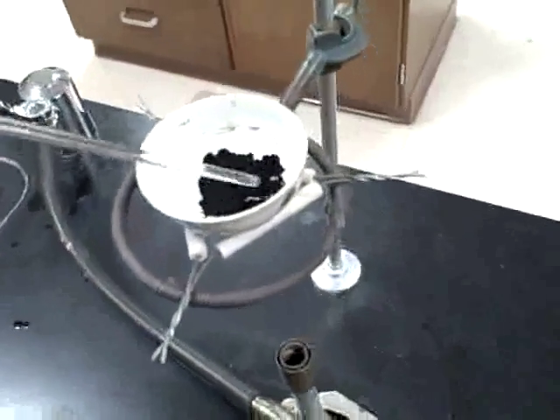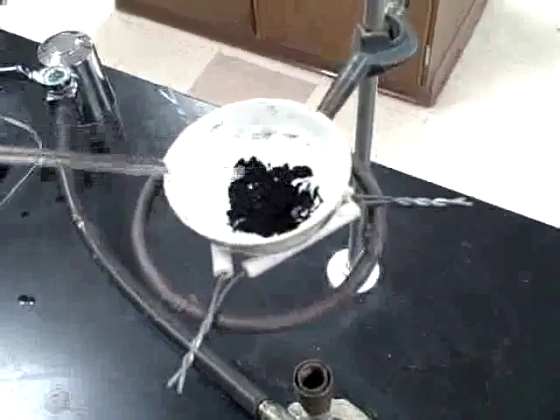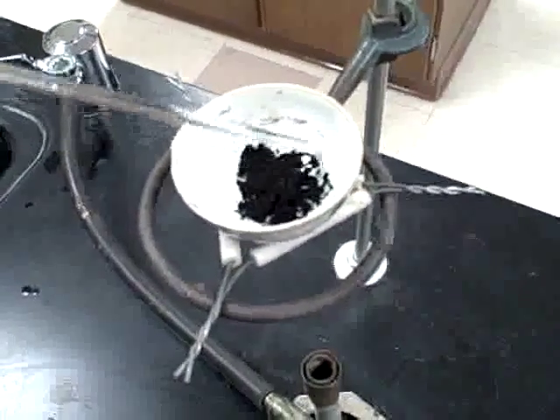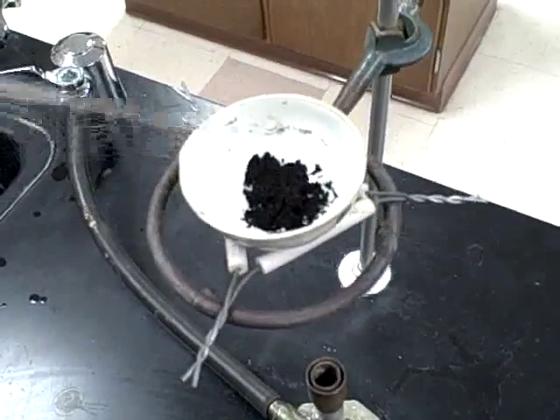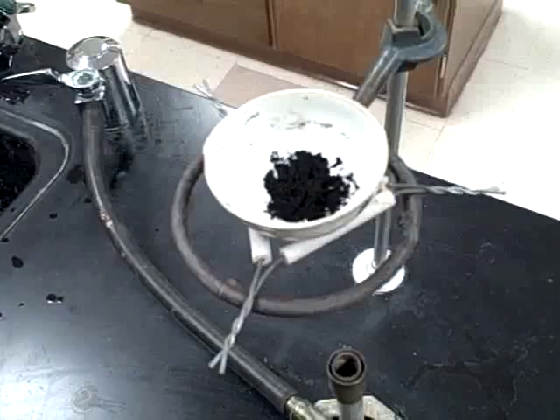After several minutes of heating, the basic copper(II) carbonate, which was green, will break down into copper(II) oxide by releasing carbon dioxide and water. We'll know the reaction is complete because the green powder will turn solid black.